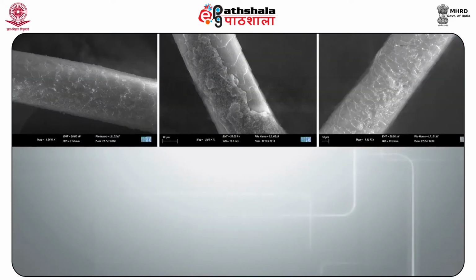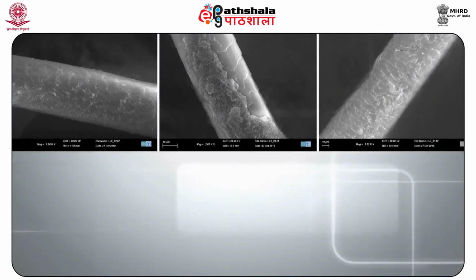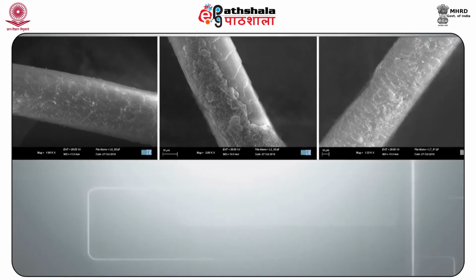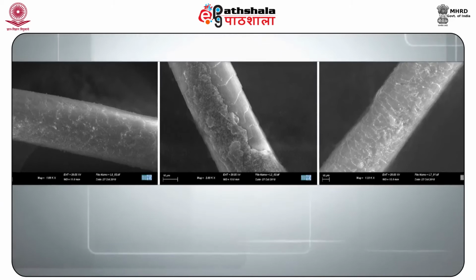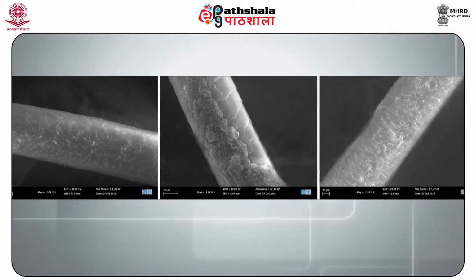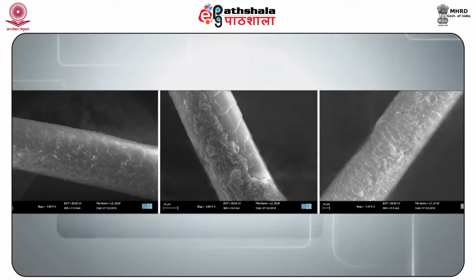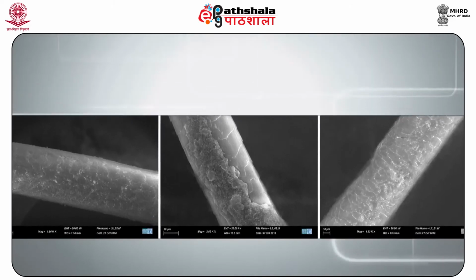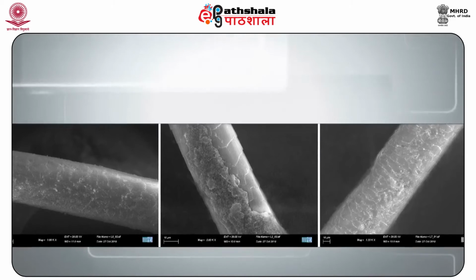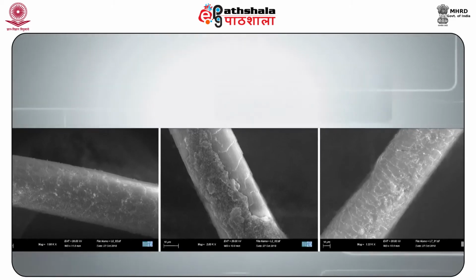Next comes the comparison microscope. While comparing microscopic characteristics here, we need a high quality transmitted light microscope. High quality objectives are very important. The objectives and the eyepieces selected should permit observations in the range of approximately 40x to 400x.